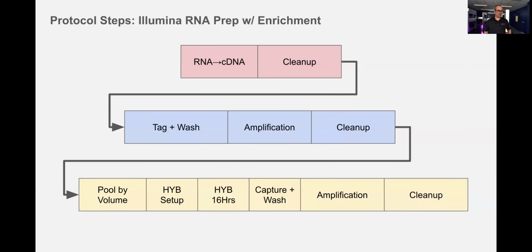Right, so I believe you're looking at my screen right now, so I have a few slides to go over what I'll be talking about. So once we got the Flex and we got all these new tools to increase the usability of the robot, we were thinking, what is the longest, largest protocol we could put onto it to demonstrate how well it could work?